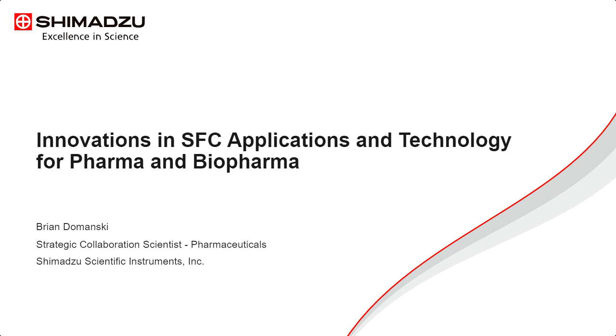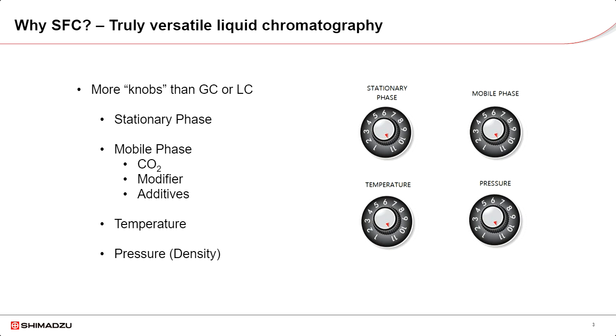We are going to be discussing some current SFC applications, some relatively new technologies that have been introduced, and how those can have an impact for us in the pharma and biopharma fields. While this is in no way intended to be a theory course on SFC, but rather a forum to talk about new and exciting applications, I do want to take a moment and consider what makes SFC special and adds a dimension to it as a mode of chromatography that is different from traditional LC methods.